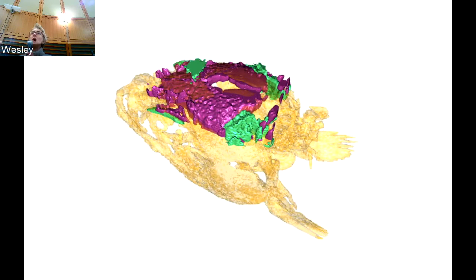And again, Osman at his poster can tell you more technical details about how he's doing this and the landmarks he's using to register the images. But we're pretty encouraged by these first attempts. And I think we've really made a lot of progress in overcoming the issues of the two different types of data and some of their inherent incompatibilities.